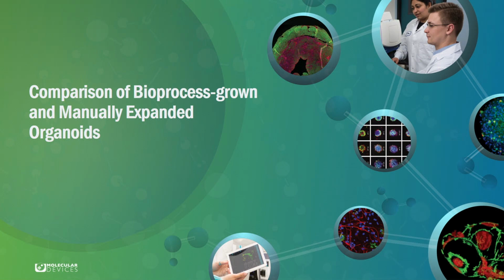So I've just got a few slides left before I hand over to Angeline. And in those slides, I just really wanted to show you some data because one question we get asked all the time is, what is this crazy bioreactor and is it going to do something insane to my organoid line? Is it going to change the phenotype? Is it going to change the behavior? What do the organoids actually look like when they come out?